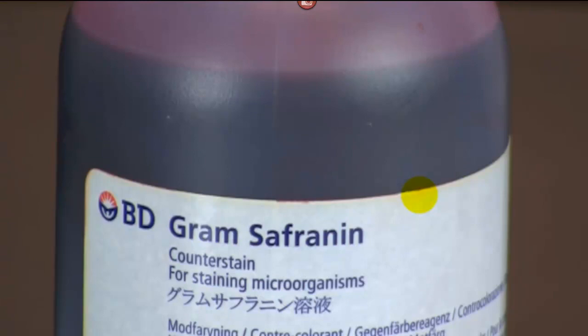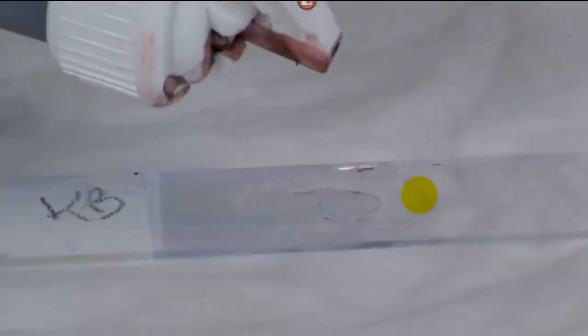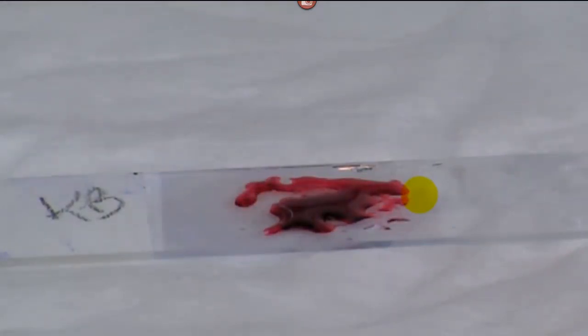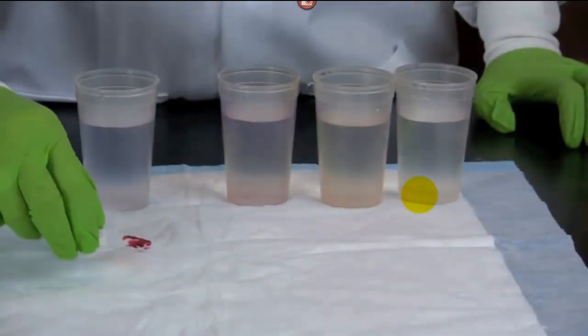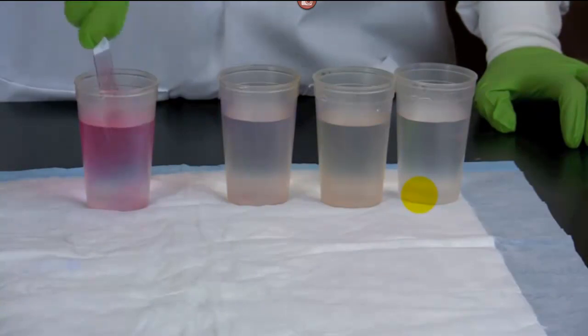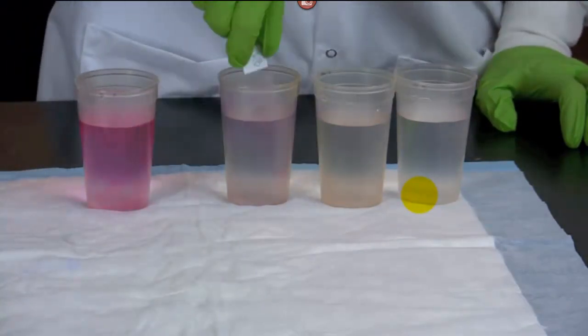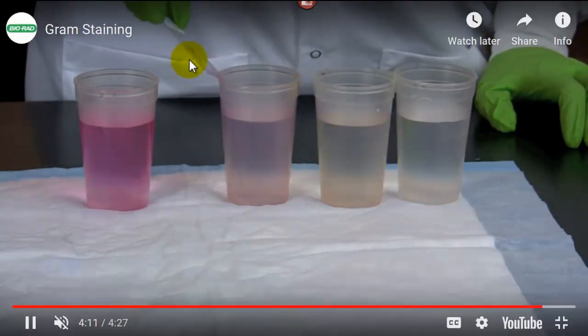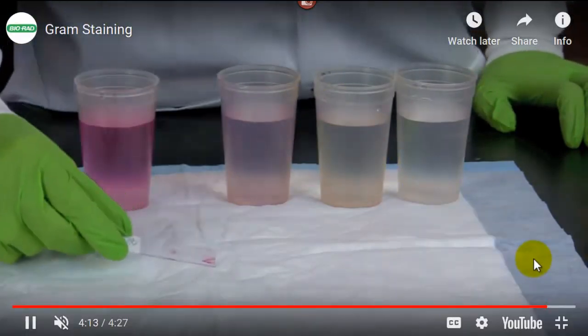And the last step, for 30 seconds, you're going to add safranin, which is a red stain. And same thing. They're going to now dip this in water. They're going to leave it there for 30 seconds. And they're going to dip it in water. It's interesting he's doing all three, it looks like. I don't know if you'd want to do the one that has the acetone in it, but that's fine. But it looks like, to me, you can see the smudge on there. This would probably be a gram negative. Yep, and it looks like it would be. And what you would do now is look at it under a microscope, and you would look for the cell shape and the arrangements.